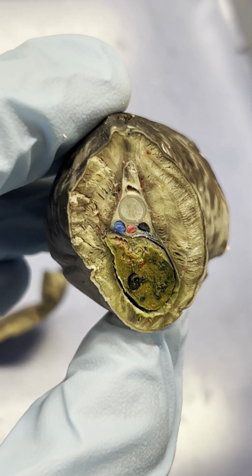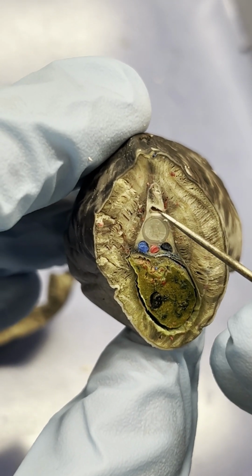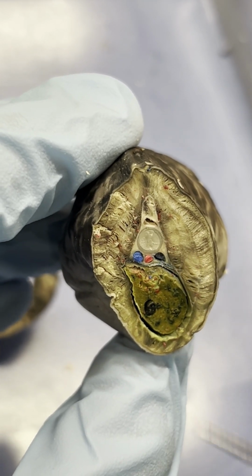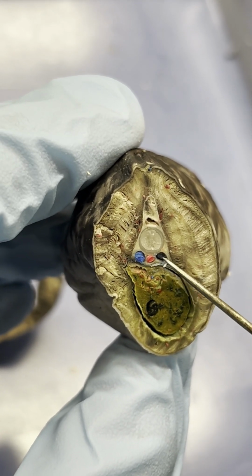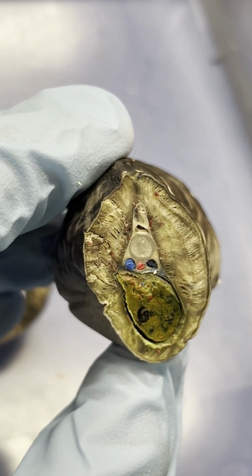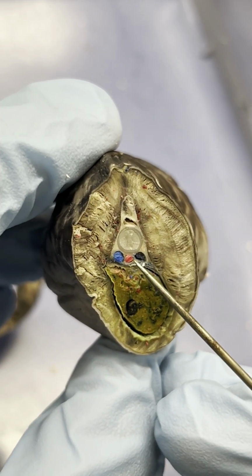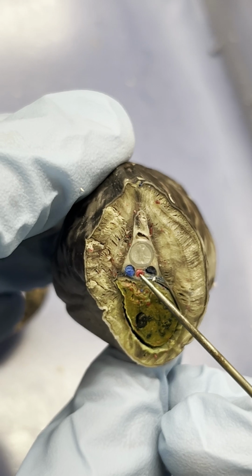This is liver and intestines, 3.6C. Getting a little focus there. Okay, so here we again have our spinal cord, which is right here, that opening. We have our notochord right here. We have our posterior cardinal veins, which are the beautifully dyed blues right here. Remember what I said about veins carrying deoxygenated blood back to the heart. This red right here is the dorsal aorta, also beautifully dyed. The aorta is a type of artery.